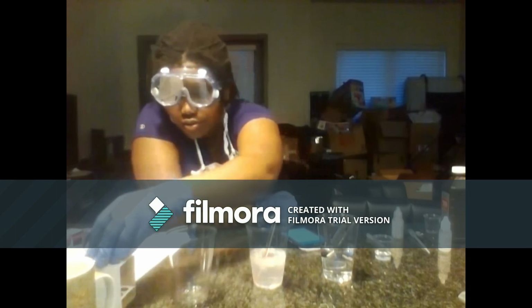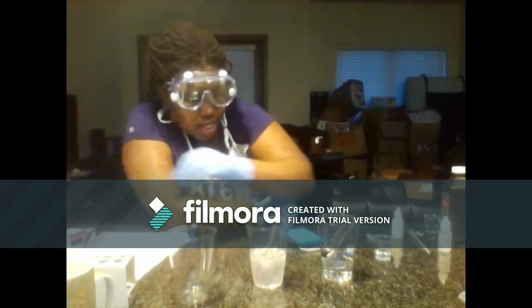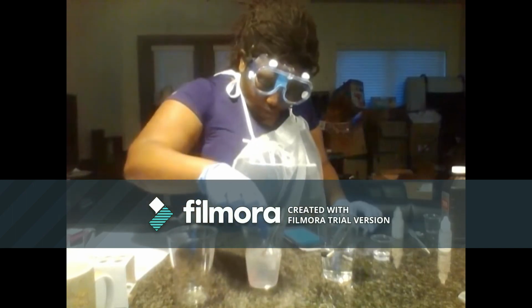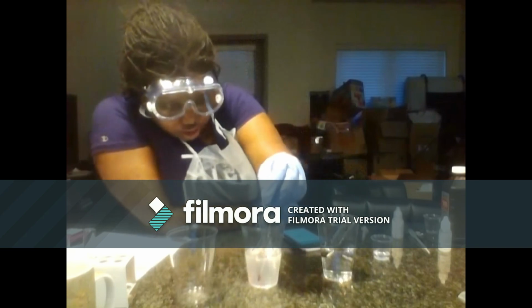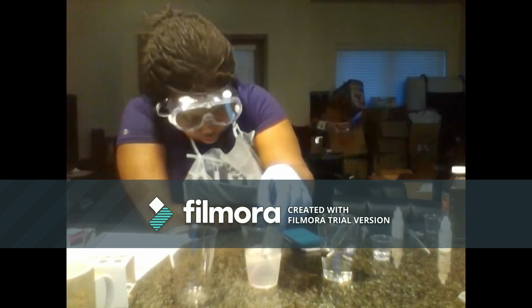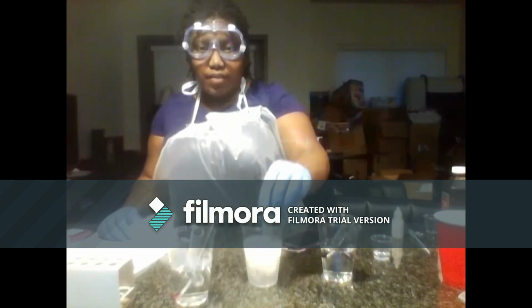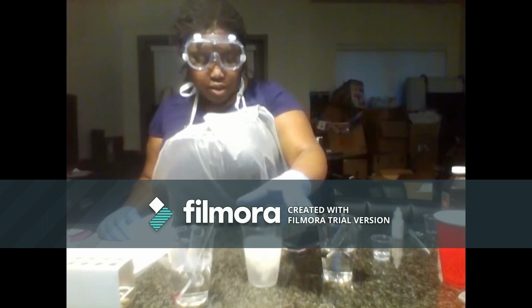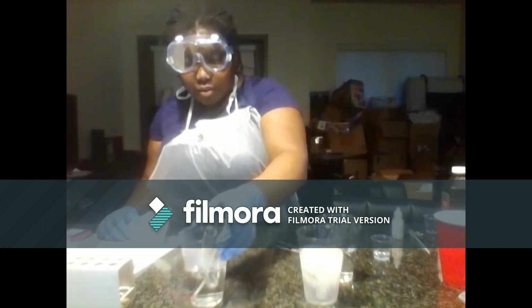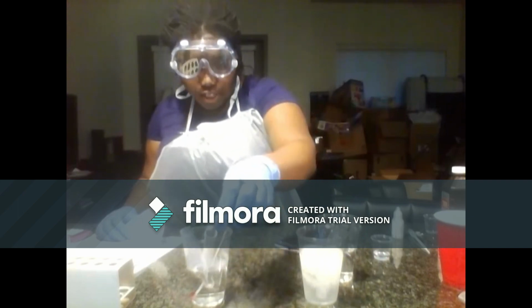And I'm going to put my next test tube in my cold water bath and some more hydrogen peroxide. I'm going to let those reach the appropriate temperature in the cold bath. Alright, so my cold water bath reaction finished, and my cold water bath temperature was recorded at 6 degrees. And now my hot water bath, I got the temperature at 44 degrees right before I used it.